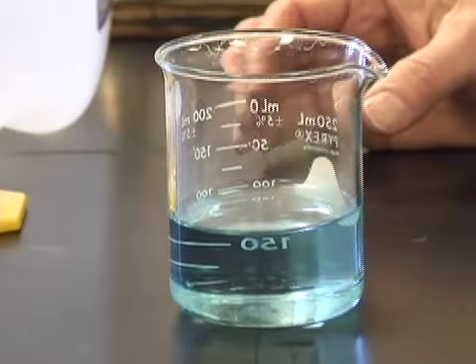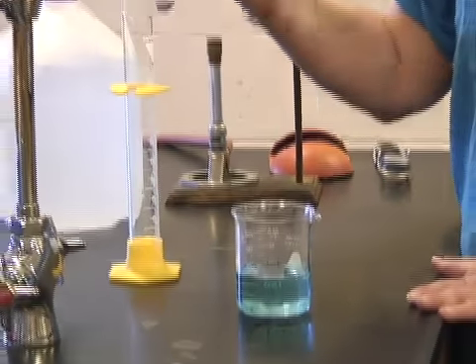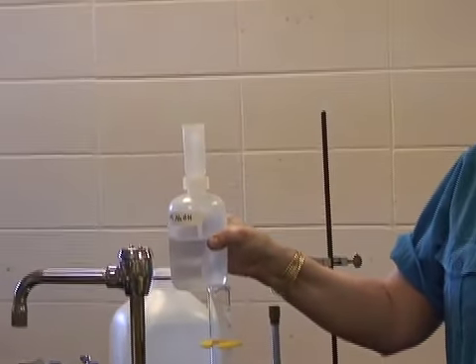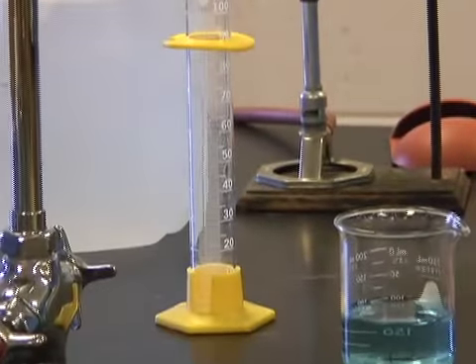Now the next part of what I'm going to do is add 30 milliliters of my sodium hydroxide, that's 3 molar. I can squeeze these containers, but I need 30 milliliters and this is only going to give me 25. So I need to use this graduated cylinder to get the 30 milliliters.